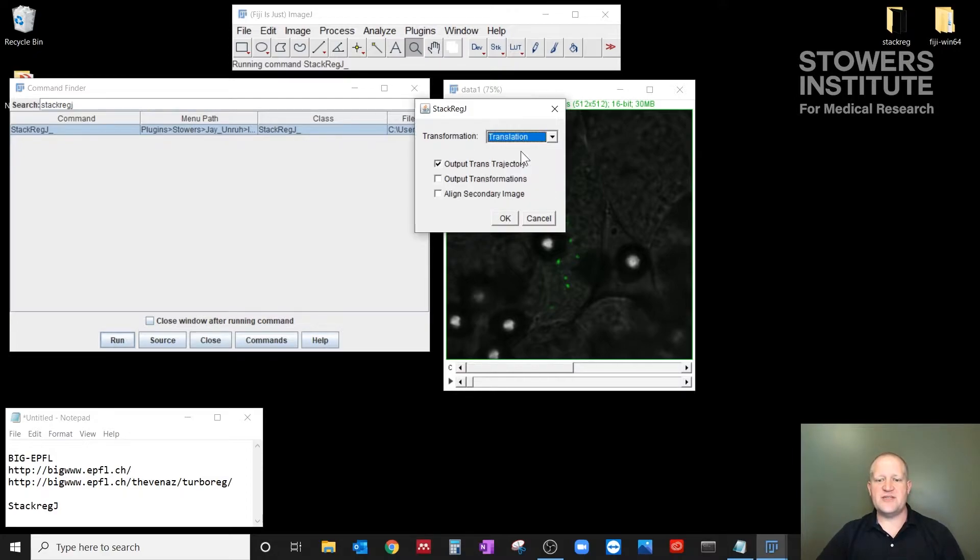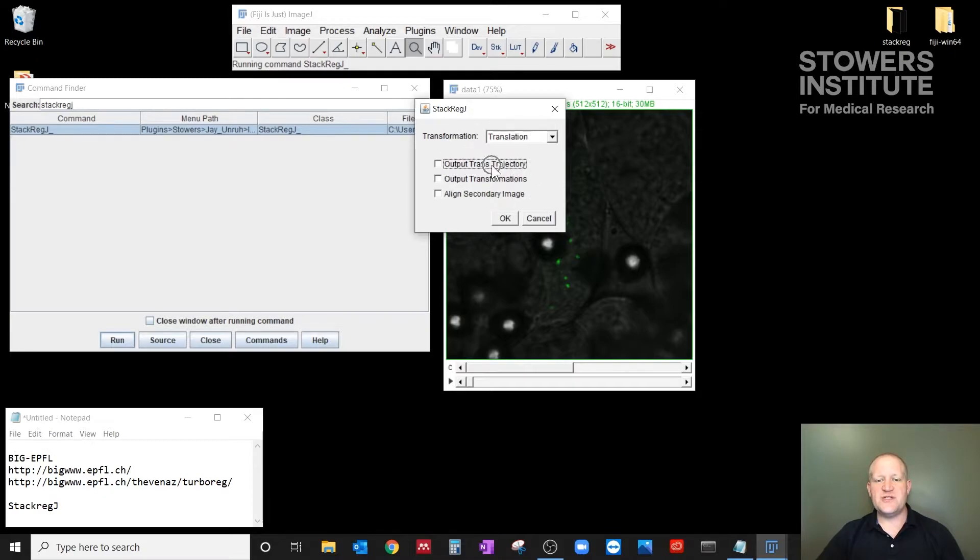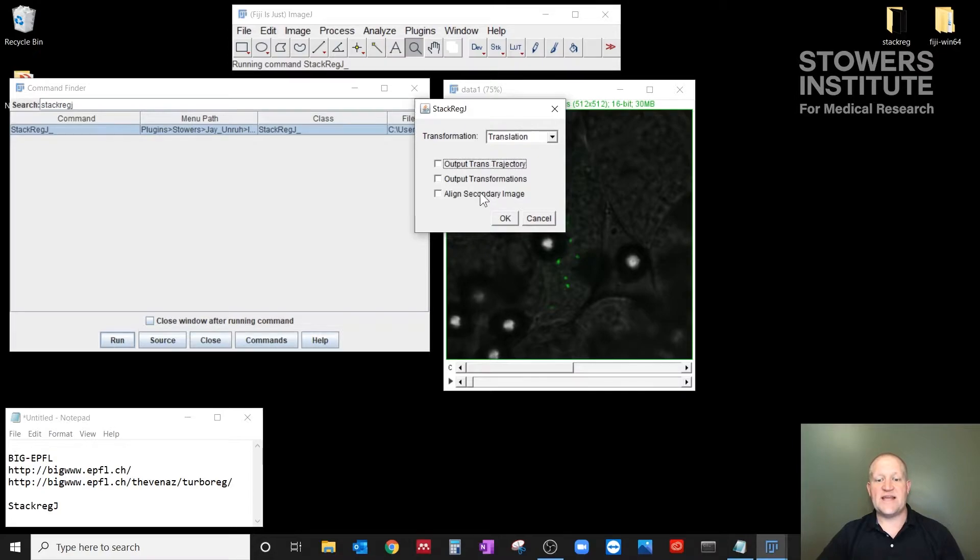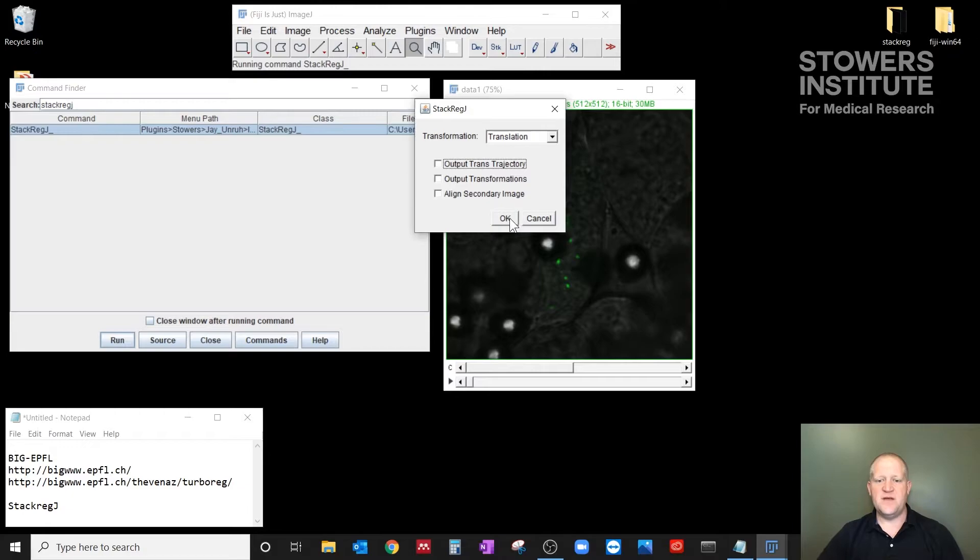So select translation, and then I like to unselect the rest of these options because I don't have a secondary image. But what this will do is the translation trajectory will output a plot window in which you can then align a secondary movie using a different plugin. So we're going to leave these off for now, and then maybe in a later video we can show those methods.